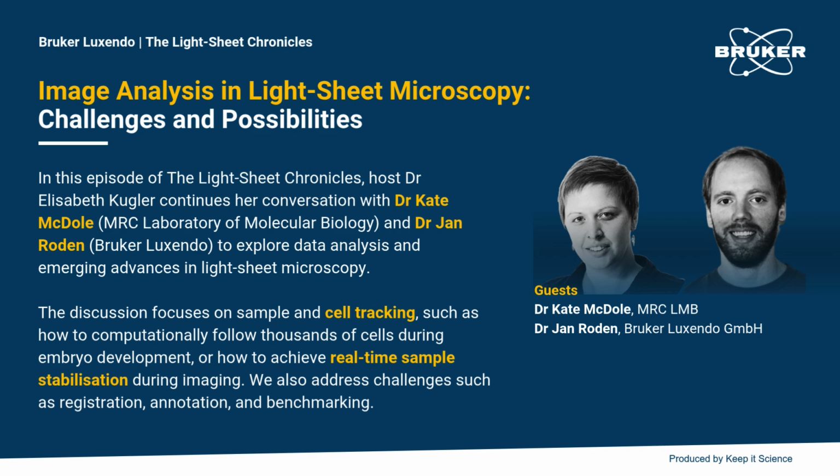This episode will focus on sample and cell tracking, such as how to computationally follow thousands of cells during embryo development, or how to achieve real-time sample stabilization during imaging. We also address challenges such as registration, annotation, and benchmarking.